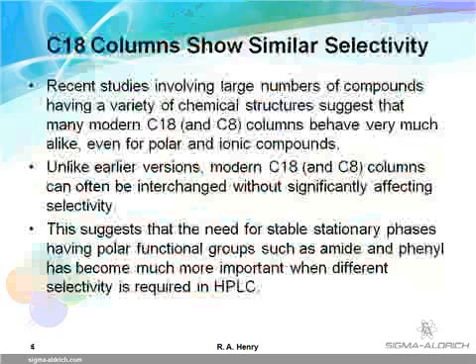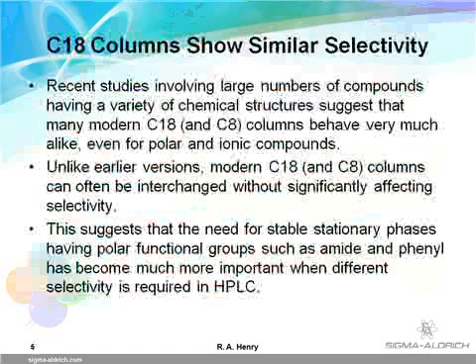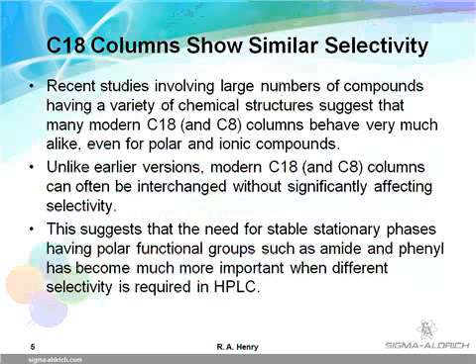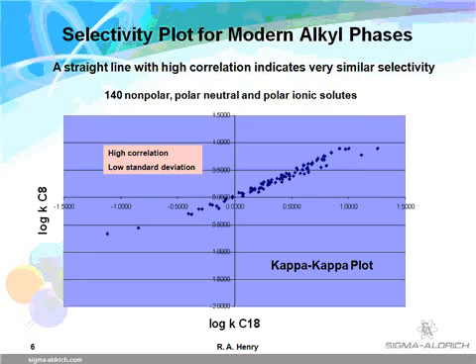The next slide suggests that modern C8 and C18 columns are becoming much alike due to evolution of silica particles and development of improved bonding chemistry. Changing from a C18 to a C8 or from one brand of C18 or C8 to another may not produce a different, better result. When resolution is not acceptable for any reason, an alternate stationary phase with more polarity than C18 or C8 may be the answer. This seminar will describe how polar stationary phases, such as Ascentis Phenyl and RP-Amide, can play a unique and important role in changing retention and selectivity for certain classes of compounds.